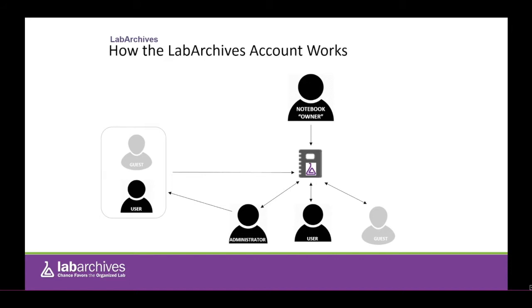An administrator can be given the same rights as the owner, but they cannot access Manage My Account and they cannot delete the notebook. A user is a paid account that can be given edit or view only rights. A user cannot share a notebook. A guest is an unpaid account that can be given edit rights for 60 days. After 60 days, the guest access will become read-only. A guest cannot share data, but they can be given comment privileges. Also, guests cannot be added to groups and they cannot be given witness rights.